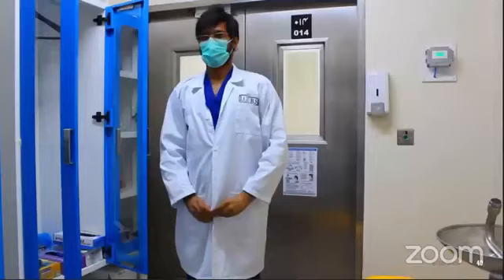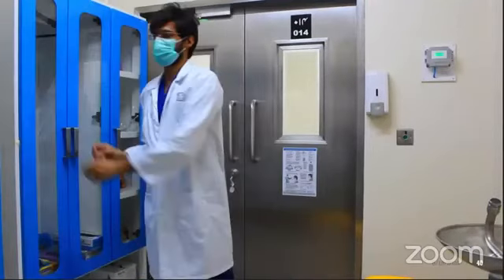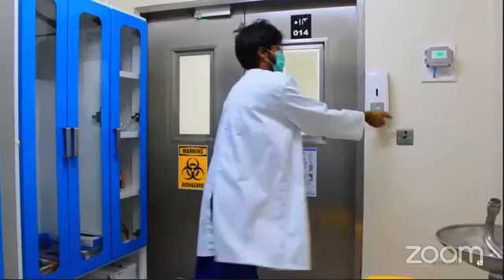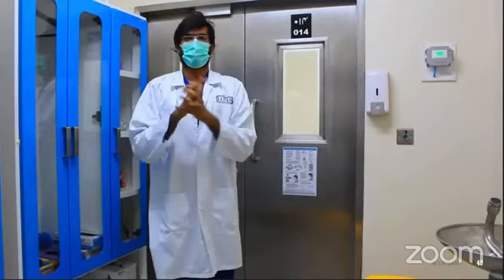Now put on the lab coat. Sanitize your hand again.